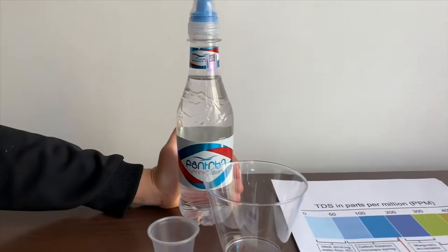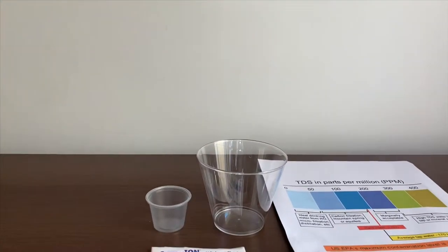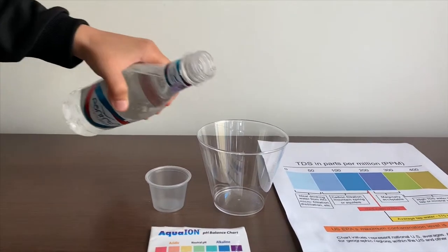This is Buda sporting natural spring water from Armenia. Let's test the pH and TDS levels. Let's pour some water in.